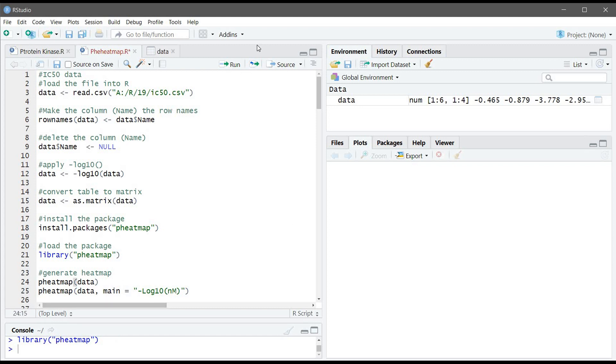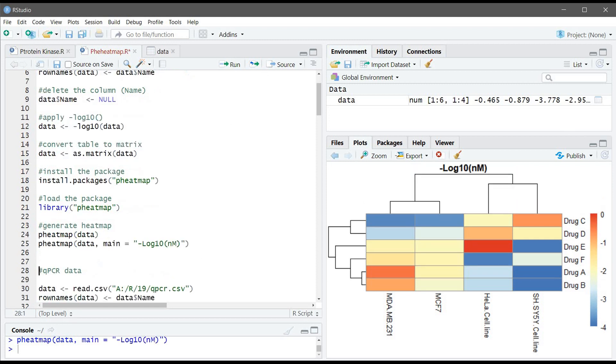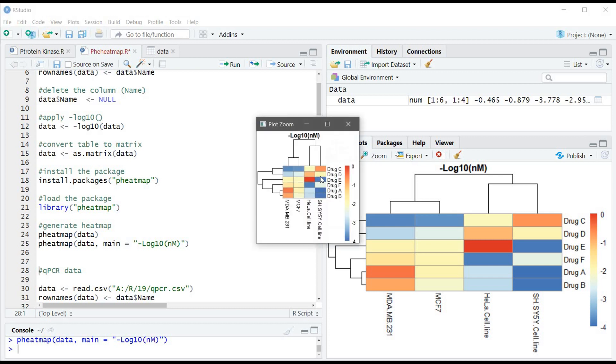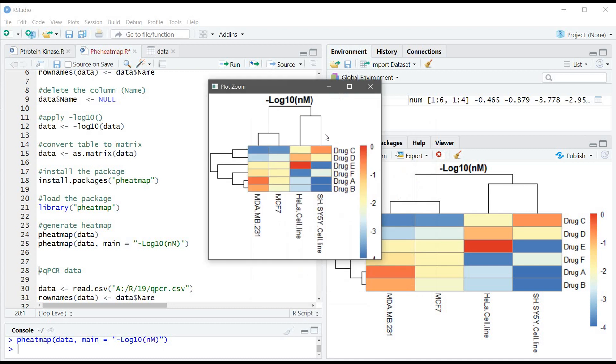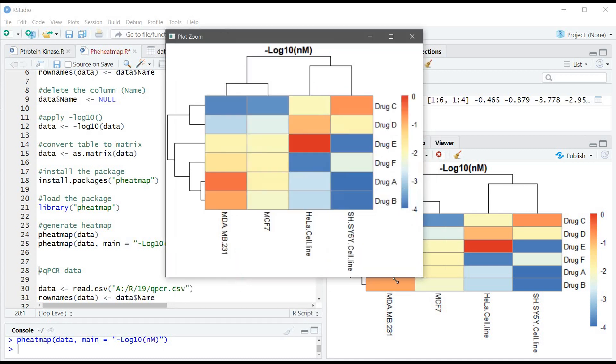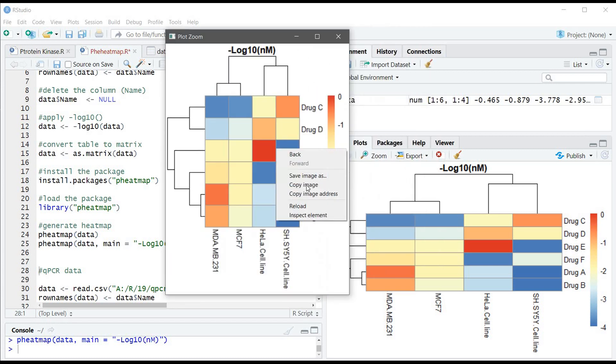Now we can generate the heatmap simply by using the pheatmap function. So we have the heatmap right here. Also if we want to add a title we can just use the main argument. So to save it you can use zoom and you can play with it. It will give you a better way to control it and then you can just copy and paste it in your Word file or in your PowerPoint.